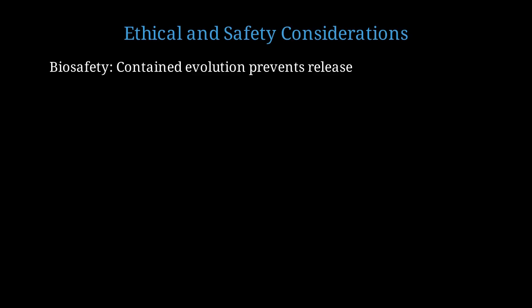We should also consider ethical and safety aspects of this powerful technology. From a biosafety perspective, droplet-based evolution is actually safer than some alternatives. The entire process happens in contained droplets. Evolved organisms aren't released until they're characterized.